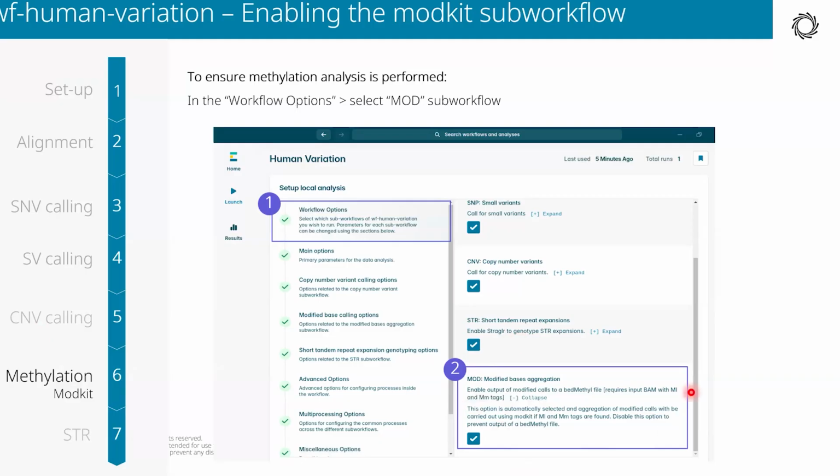The alternative, of course, is the BAM file, which is going to be aligned to your reference. So you could, if you wanted to, use that information. And some of the tools that we'll talk about can use that BAM file directly if you want to use them.